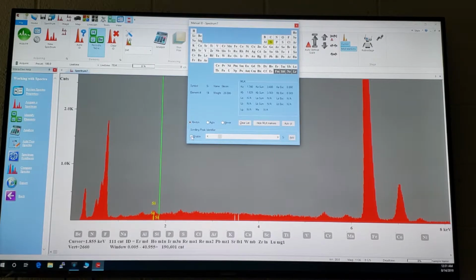See this? This is the old Chemex trackball, which was a really good system. See how it starts at the first element, hydrogen, and we keep moving to the right: helium, lithium, beryllium, boron, carbon. Whoa! Carbon just lined up with something over there. Add. Keep going. Oh, hang on a second. Oxygen. Add. Keep going. Nope, that didn't line up. Sodium, yeah, that lines up. Add. Keep going. Add. Keep going. Add. Keep going. Whoa, that was a big one.